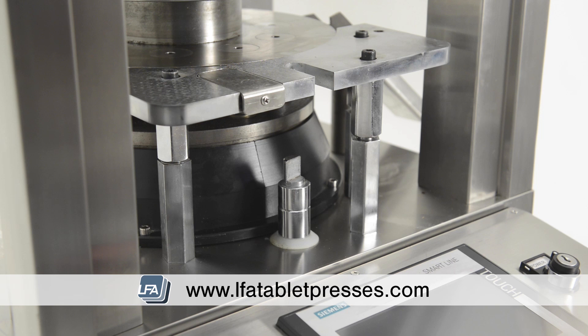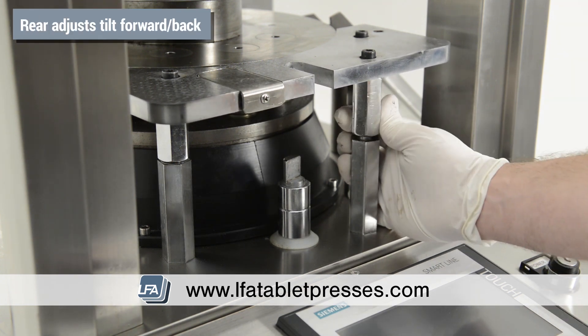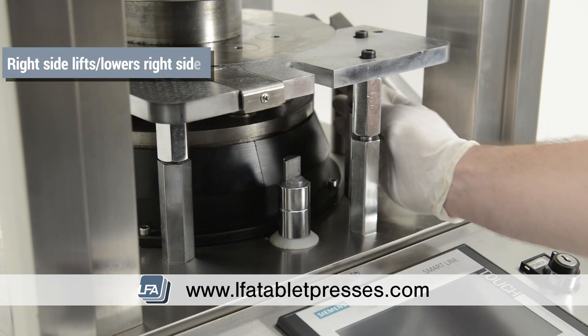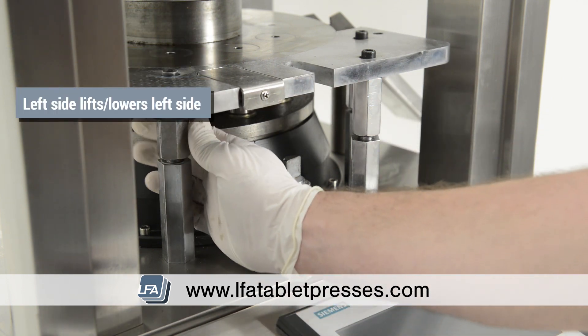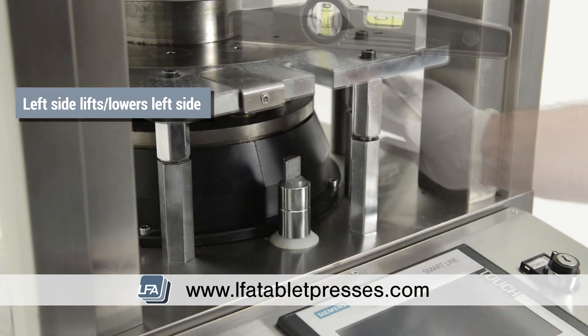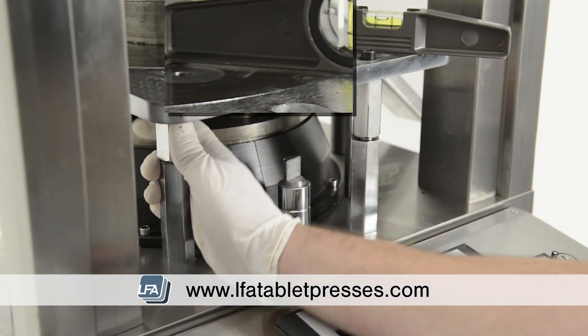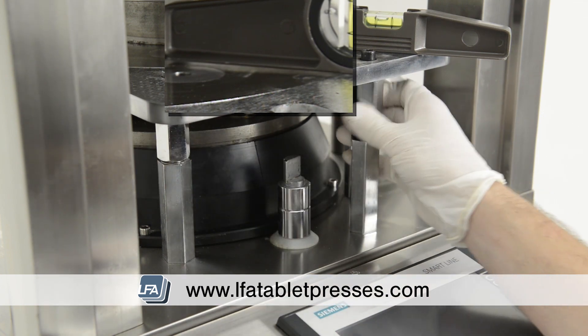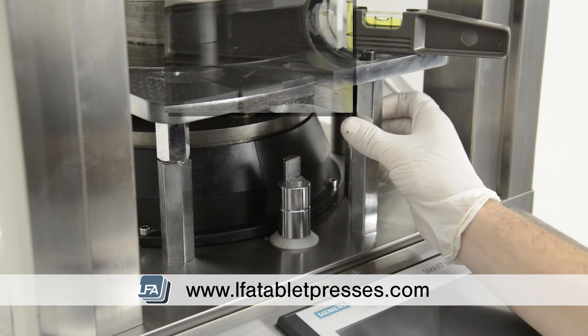There are three adjusters under the plate. Each one adjusts a different side of the plate. We're aiming to have the plate flush with the die table. The rear adjuster adjusts the tilt forwards and backwards. The right side adjuster raises and lowers the right side of the plate and the left side of the plate. To make adjustments we're going to be using a straight edge — place it on the force feeder plate and the die table.